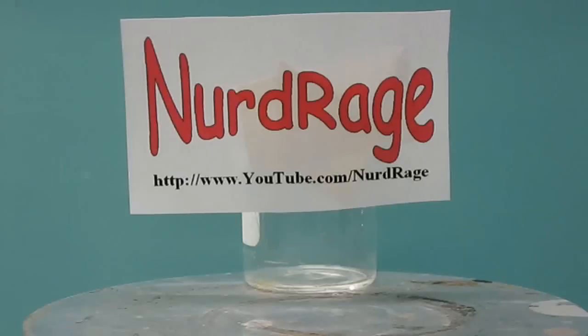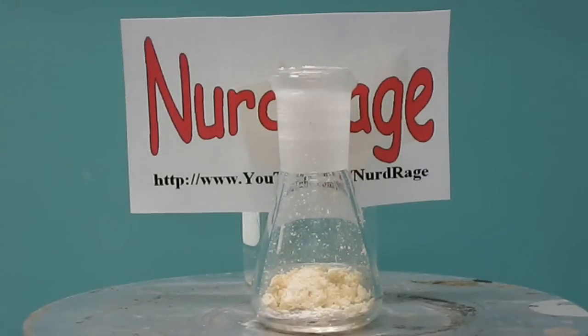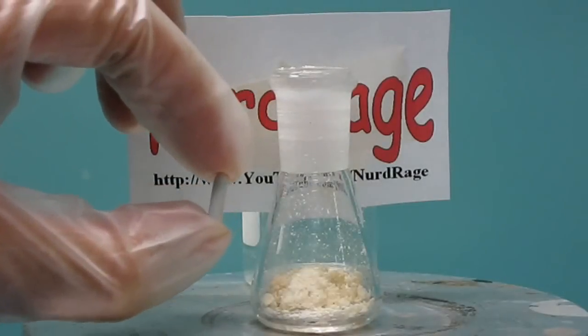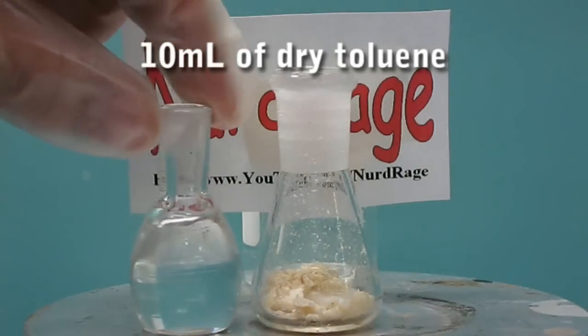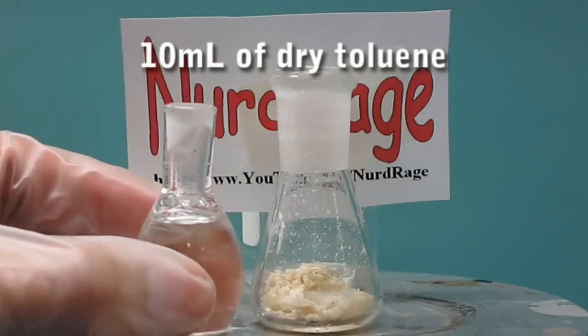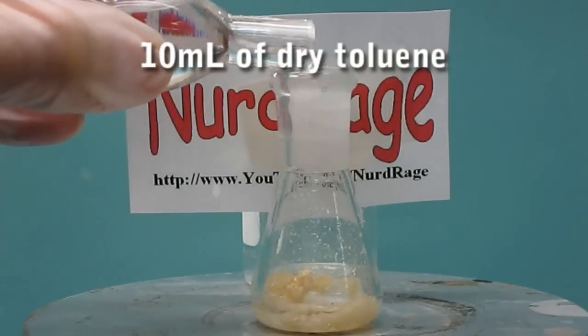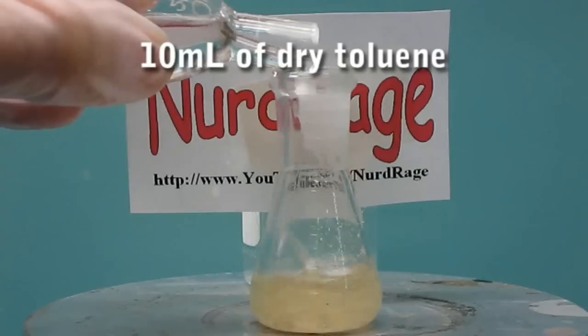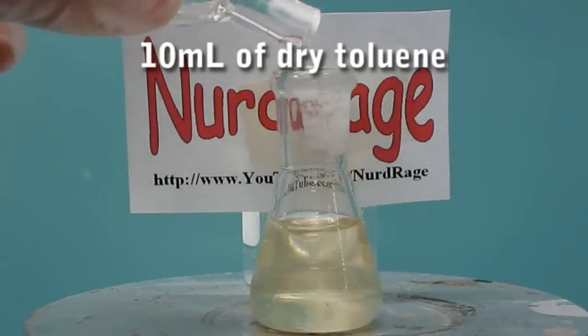Working at this size is cheap, but requires a steady hand and attention to detail. Let's get started. Weigh out 700mg of 2,4,6-trichlorophenol. Then add a tiny teflon-coated magnetic stir bar and turn on the stirring. Now add 10mL of dry toluene and stir until the trichlorophenol is completely dissolved. We use toluene dried by the sodium benzophenyl method, but you can use toluene dried by molecular sieves or azeotropic distillation.